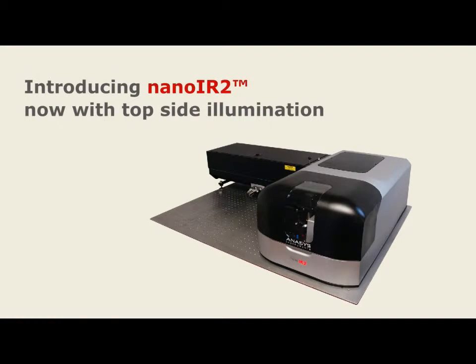I'd like to introduce AFM-Based Infrared Spectroscopy. This is what our product looks like, the Nano IR2.